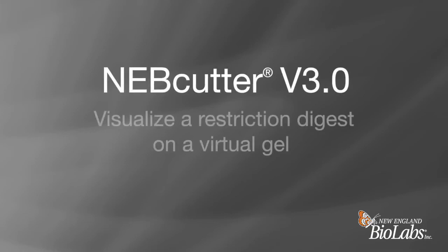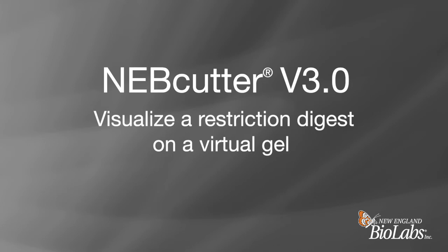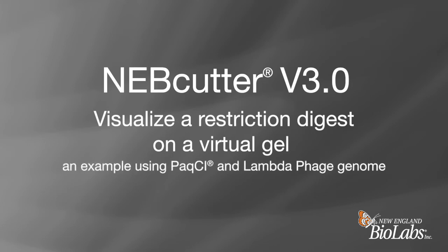With NEBcutter, you can visualize a restriction digest on a virtual gel. Let's walk through an example using PacI and the lambda phage genome from NEB.